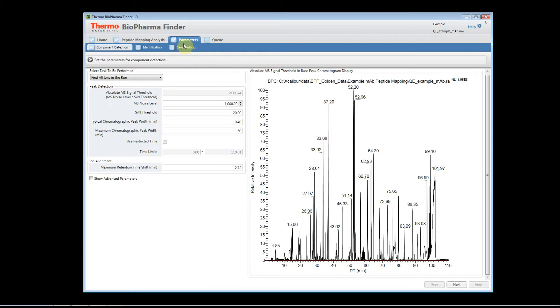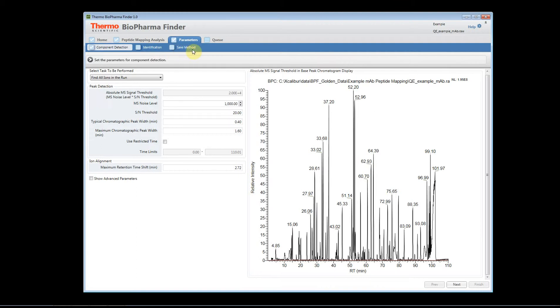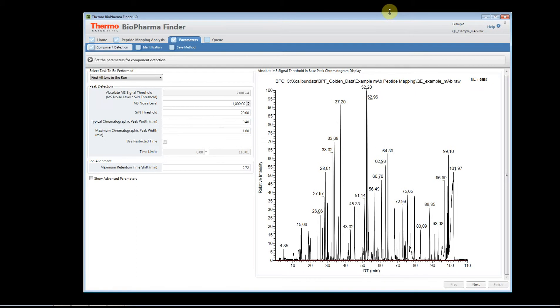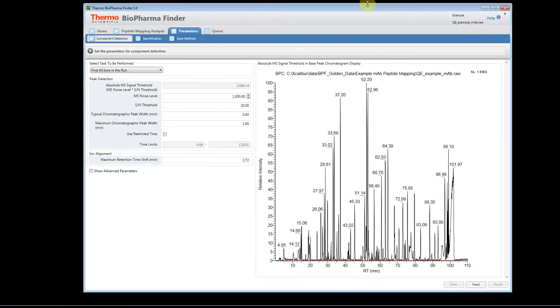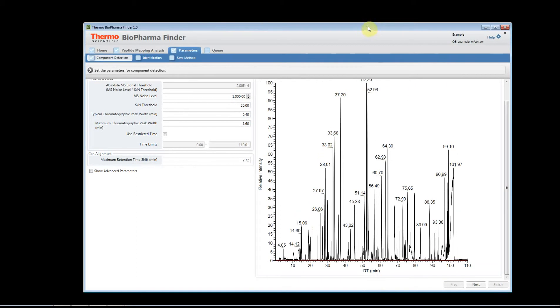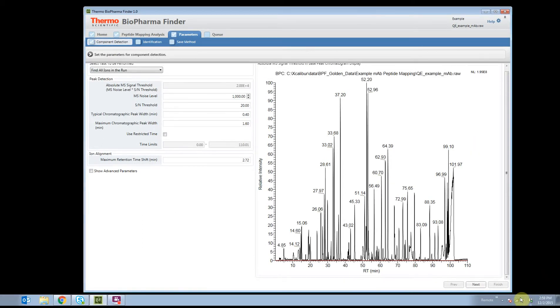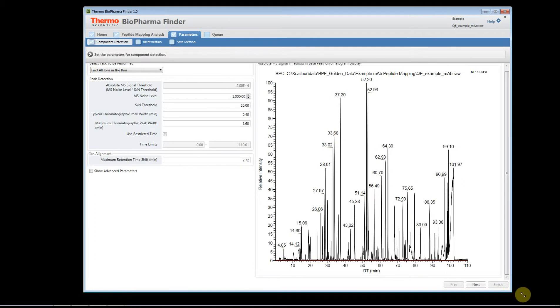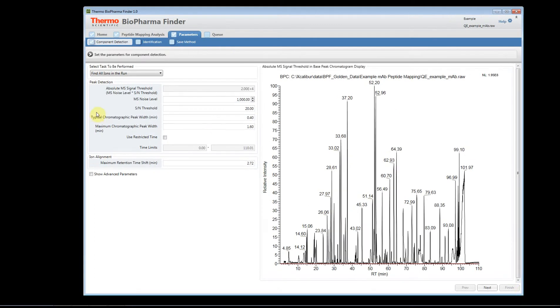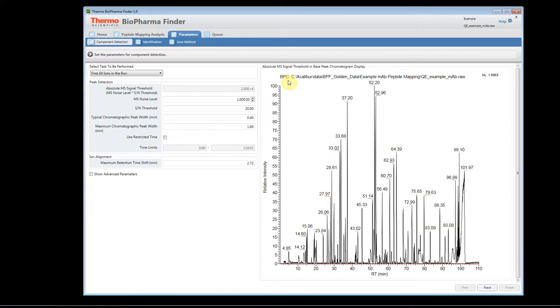Now we're in the parameters page where we can look at and interact with the data file in terms of our parameters for data processing. These are broken up into the component detection. We have an identification tab, and then we're going to have a tab that allows us to save our methods and review our parameters. First, let's start with the component detection. You can move and resize the application to make sure that you can see the base peak chromatogram that's displayed here and all the parameters. In case it's not quite fitting on your screen, just grab the bottom of the software and extend it a little bit. Here we have a very nice interactive graphic that does show the base peak chromatogram for the first raw file. If you're bringing in multiple raw files, it'll only be for the first one.